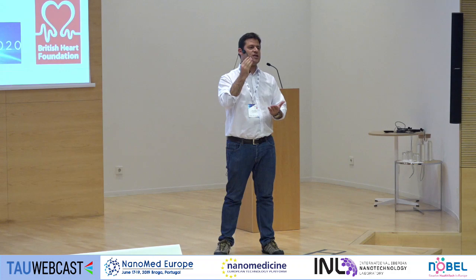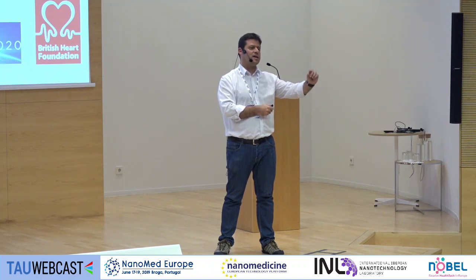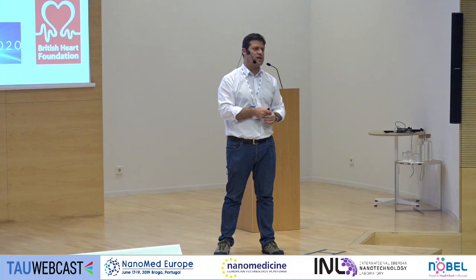So the patient enters the ER or comes to the regular appointment with his medical doctor, and they will do the routine analysis. They will just take a bit more blood. We receive the blood sample on the same day, and we assess everything typically in 24 hours, if not less. Thank you.